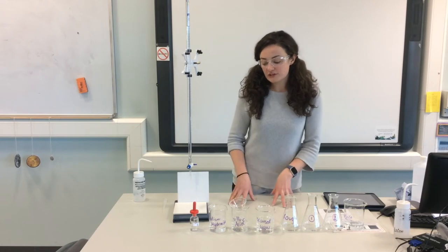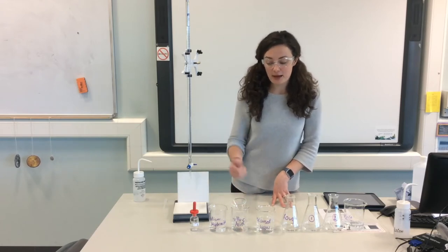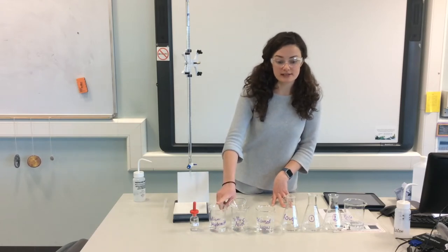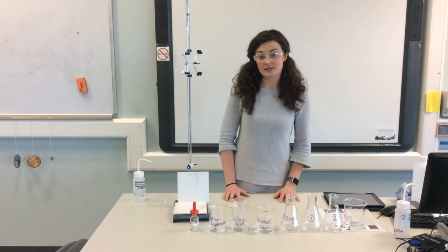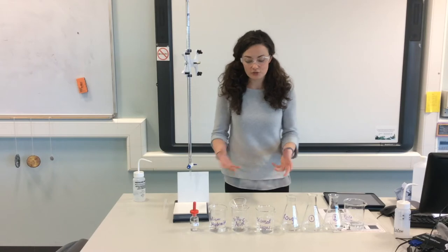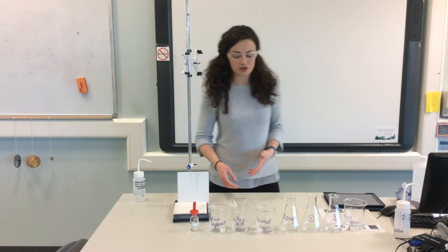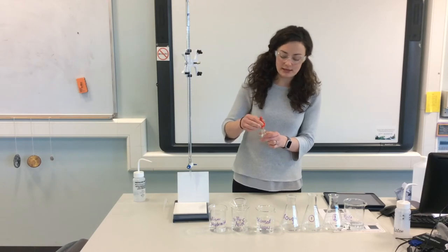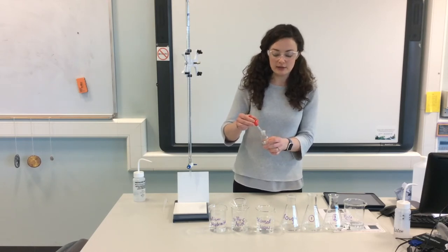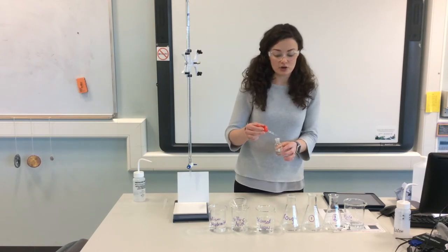Then what you saw me do was I pipetted out my sodium hydroxide into my three conical flasks, adding 25 centimetres cubed in each. So the apparatus essentially is good to go. What we want to do now is add our indicator. The indicator that we're using is phenolphthalein, and we're going to add that to our conical flask.